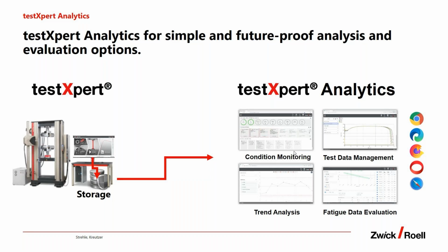As you probably know as a user of testXpert, testXpert is a file-based system where normally the data are distributed in different series files with the extension ZS2. Sometimes it's a little bit troublesome, if you are looking for historic data, to find these files on your computer, on your server, or wherever you stored them.